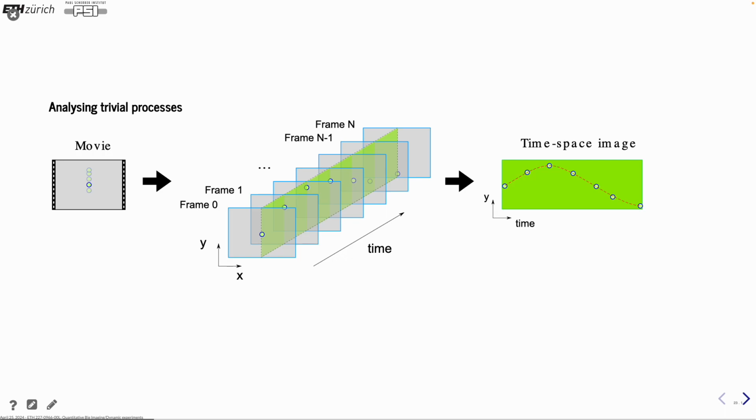And for the analysis, if we want to watch something, so let's say this was a bouncing ball, then it's only moving up and down. And tracking it from image to image may be difficult, but instead, if we extract a frame or an image in this plane, so in the YT plane, then you can see that we nicely can see where this ball is bouncing.